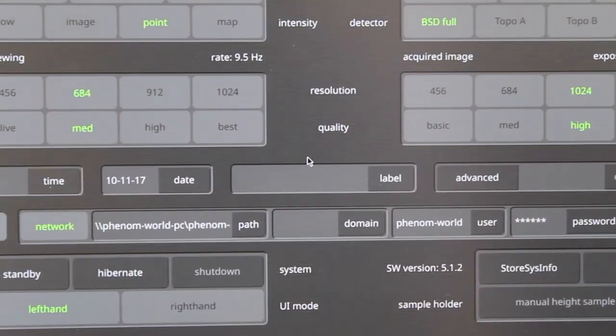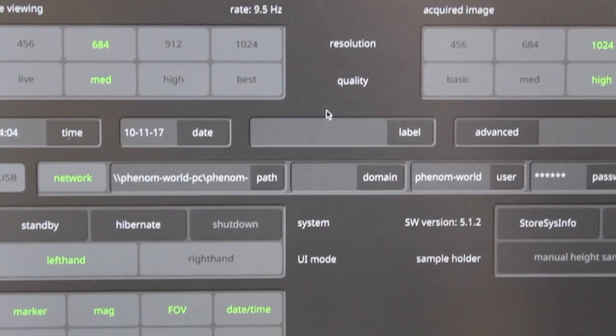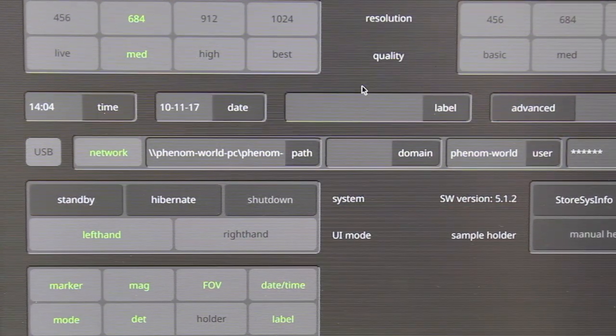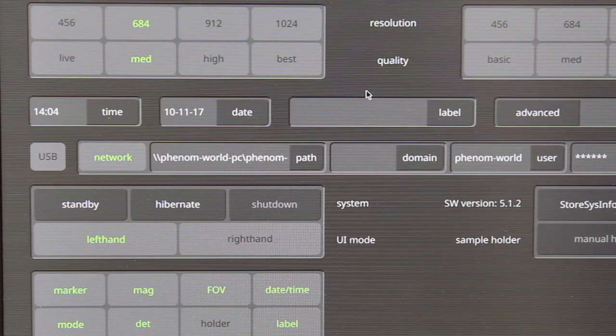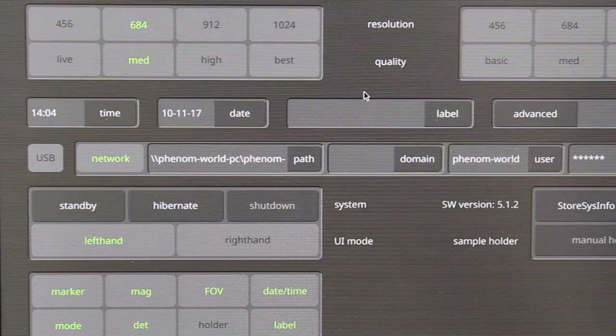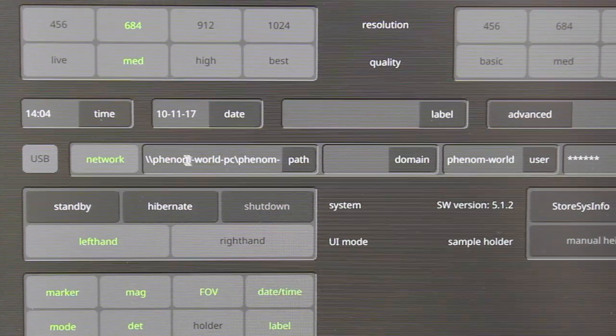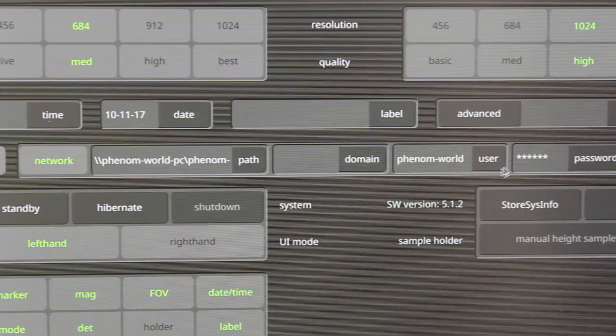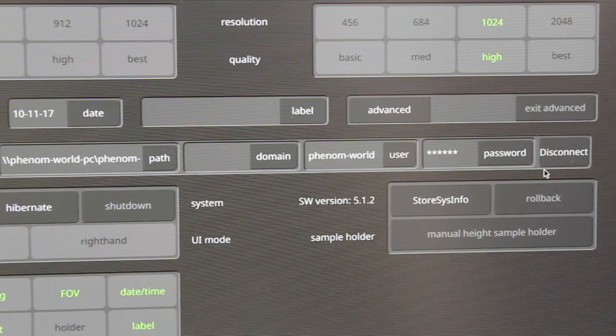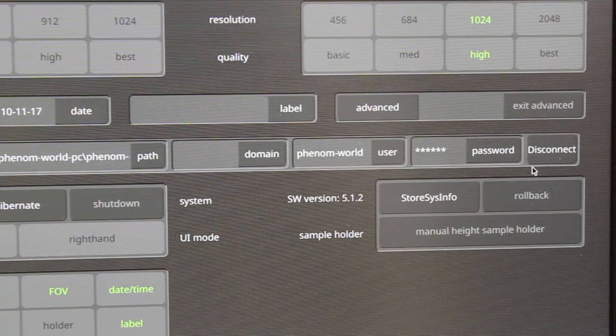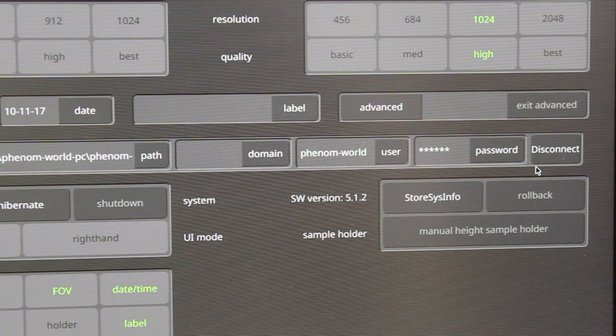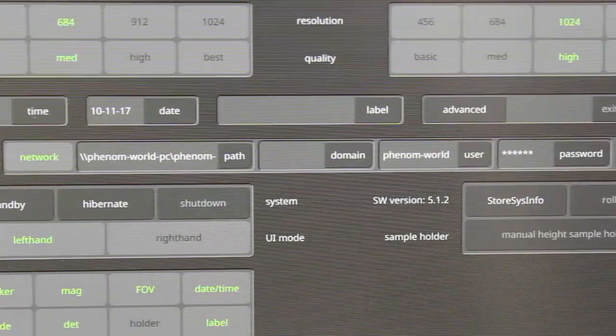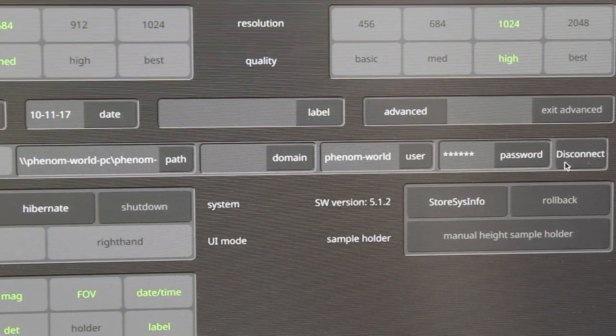For all of this, we want to have the computer on the left side connected to the computer on the right side. We want to have this network path mapped with the correct values as described in the instruction manual. Right now it's connected because it's only giving you an option to disconnect.